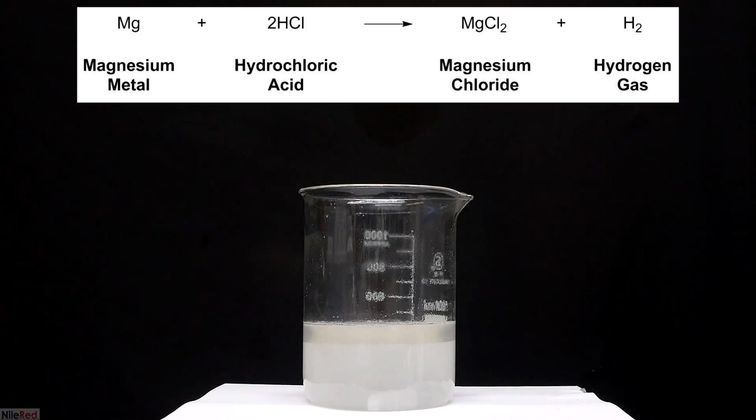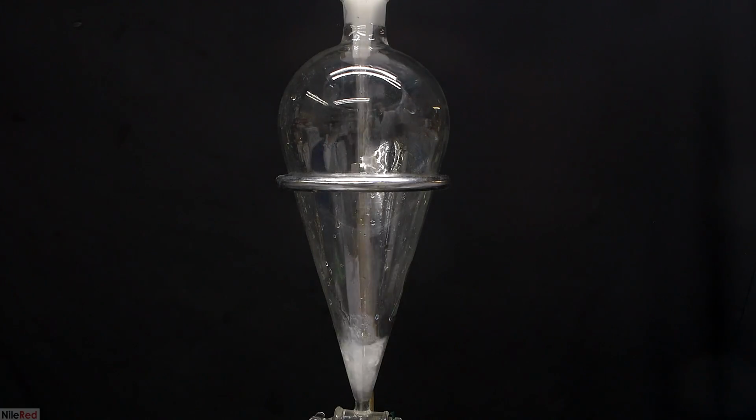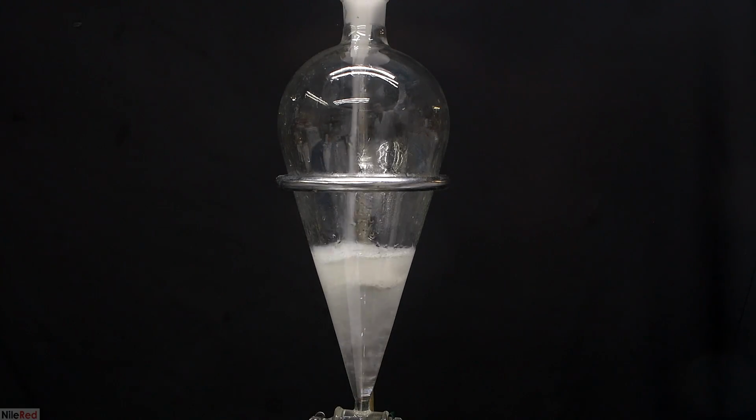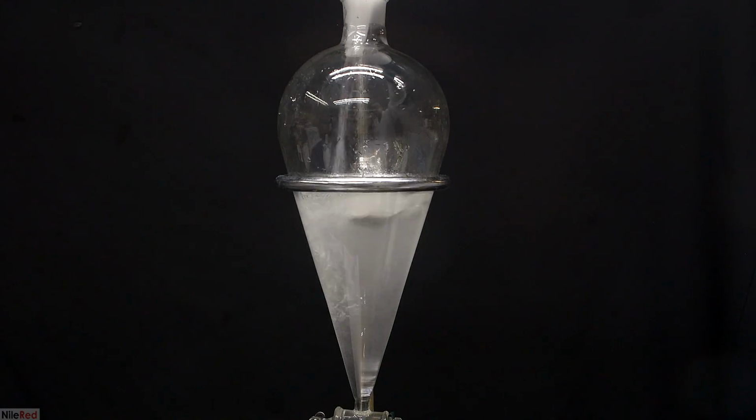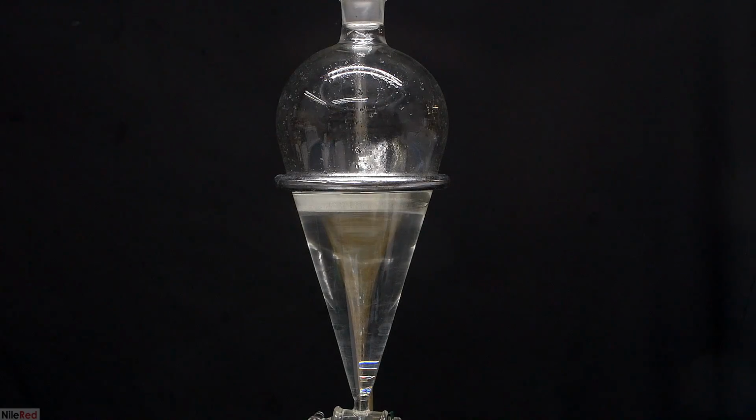At this point, there's no salt that remains, but there's a whole bunch of bubbling occurring because the acid is reacting with magnesium. I just let it stand for several minutes, and when I come back, I'm left with 2 layers with a very minimal amount of bubbling. I transfer the contents of the beaker to a 1-liter separatory funnel. After everything's added, I wash the beaker with a little bit of water and diethyl ether to make sure that everything was transferred. At this point, there's still some bubbling going on in the upper ether layer, so I decide to leave it here until it completely subsides.